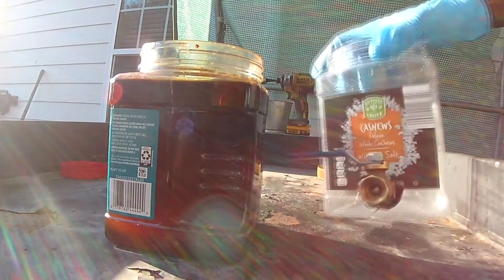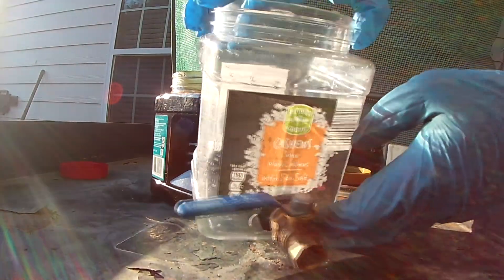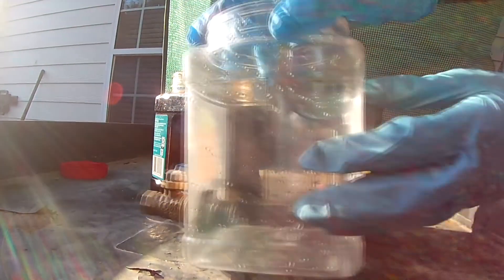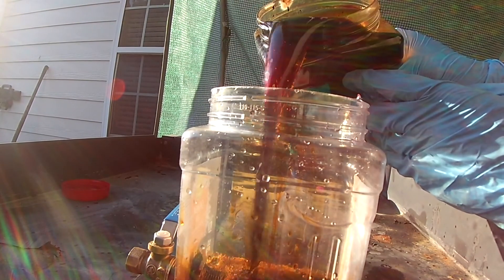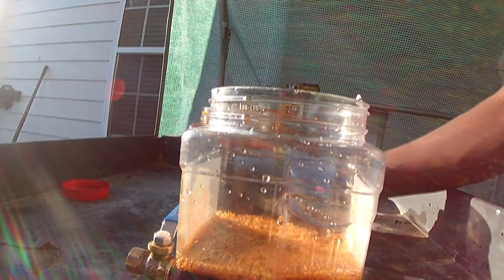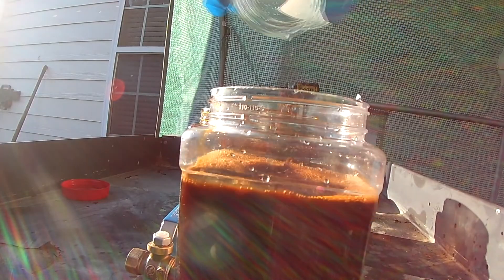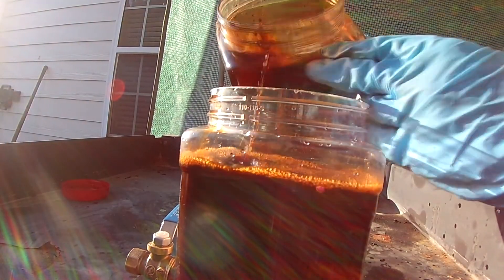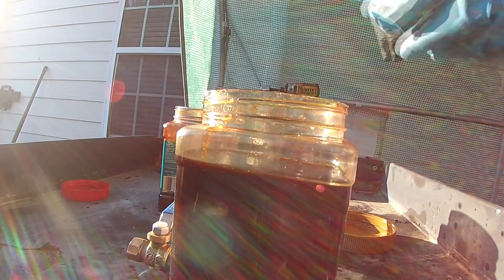Welcome back to another episode of Raw Dog and Chemistry. The first thing I want to show you is a homemade separation funnel made out of a little cashew jar. I pour this oil in here and mix it with some water, because last episode we added sodium hydroxide to this oil — it's alkaline — and we want to remove that. So I add the water, add some more oil, and shake it up so the sodium hydroxide and water can precipitate to the bottom.